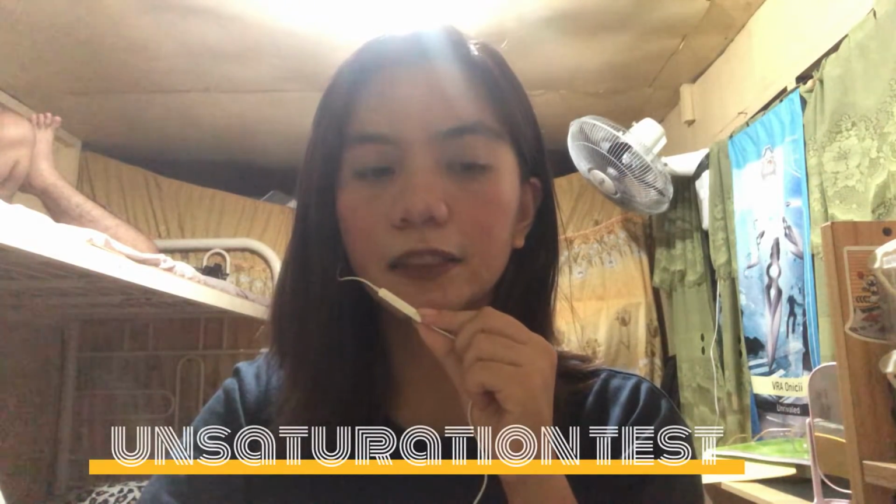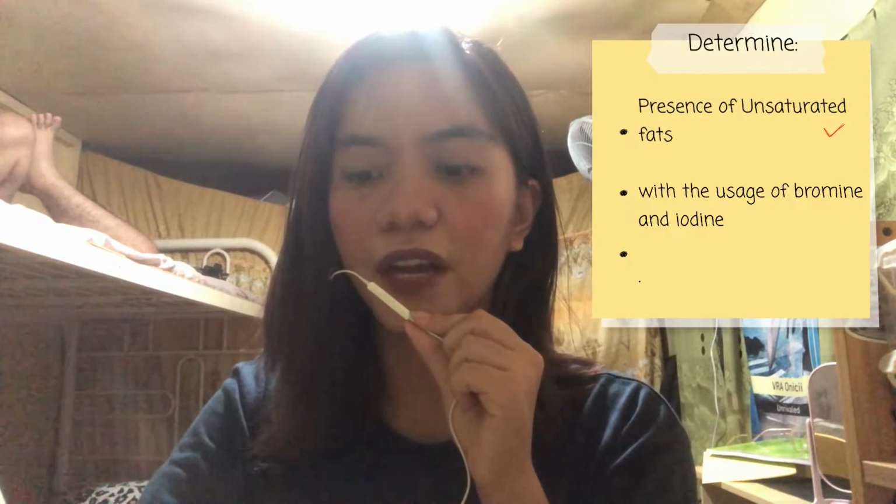Next experiment, we have the unsaturation test. In this experiment, we will be able to determine the presence of unsaturated fatty acids or double bonds in a sample of lipids. So let's get into it.